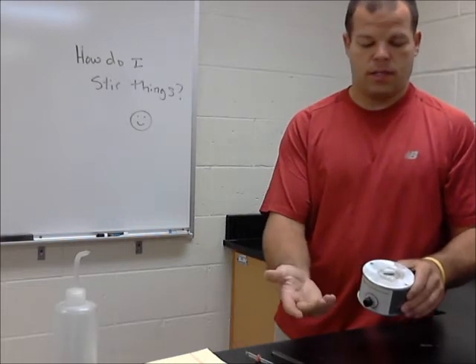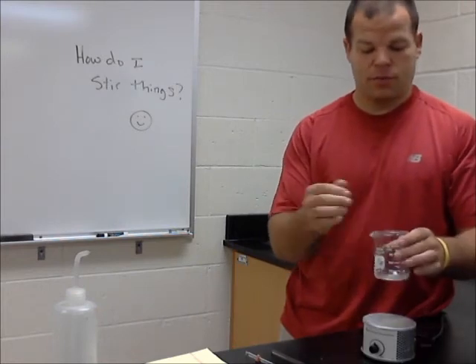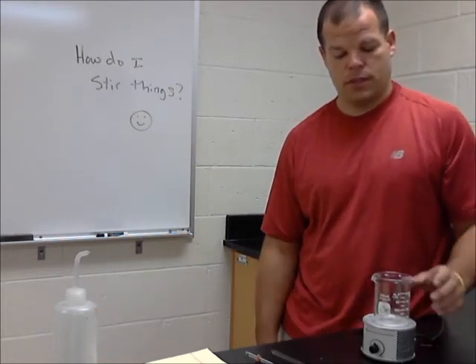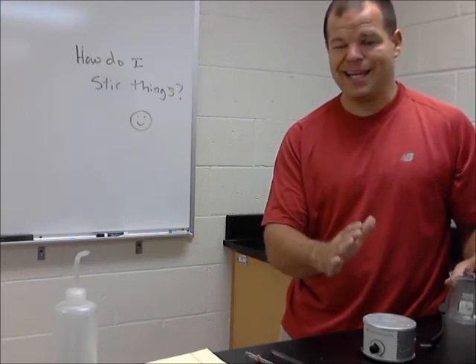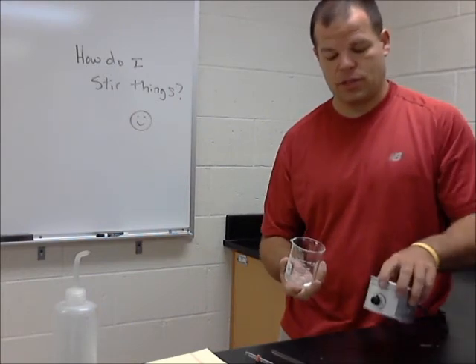This may seem strange, but it's quite cool. Take this magnet, put it into a beaker with some water, and it will stir it. This is referred to as a stir plate. There are also plates that will heat and stir at the same time. This particular one simply stirs.